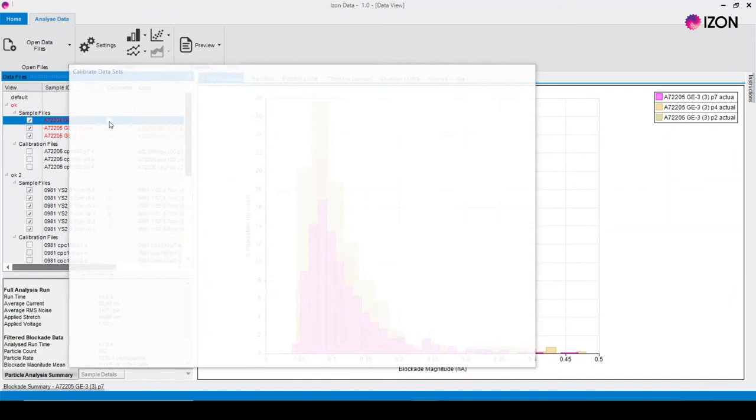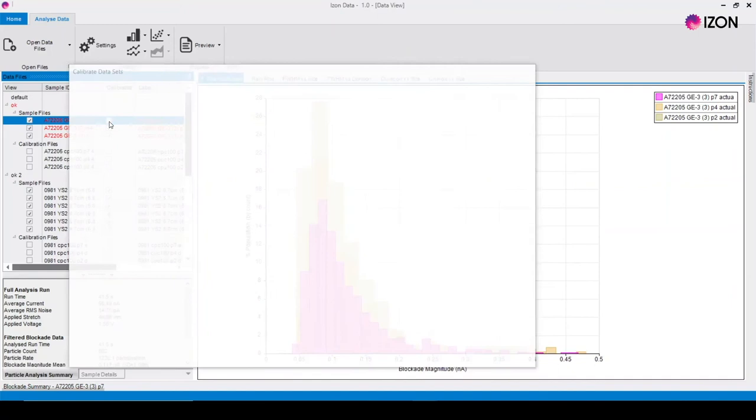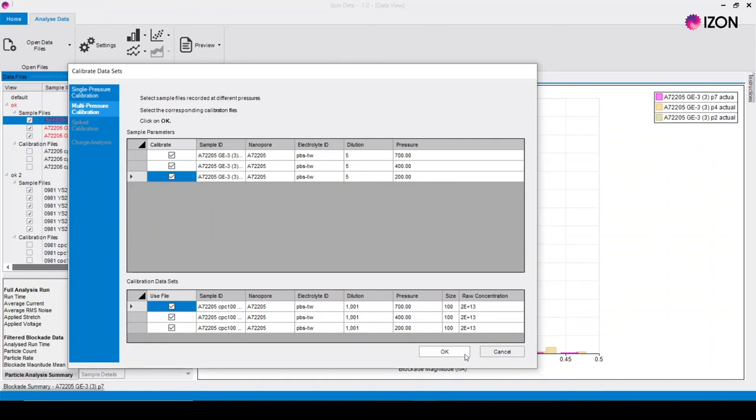After applying a filter to the data set it must be recalibrated. This can be done by unticking the box next to the sample in the calibrated column and clicking that same box again to return to the calibration menu.